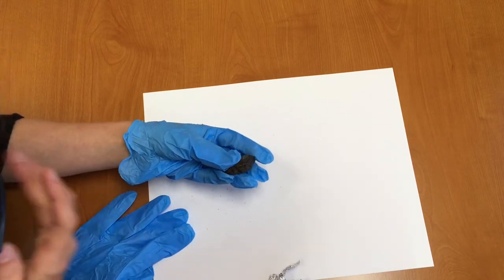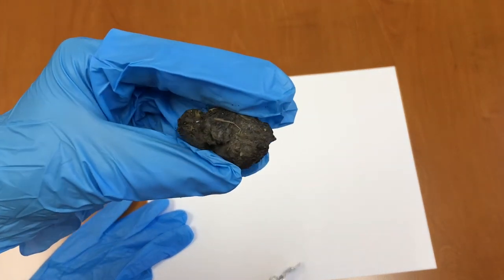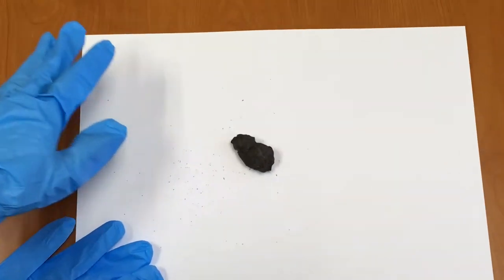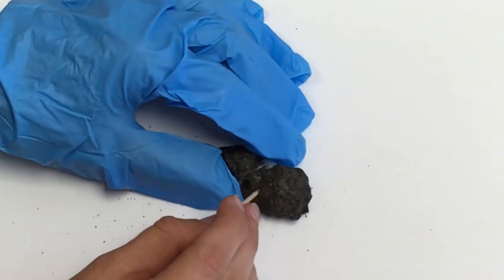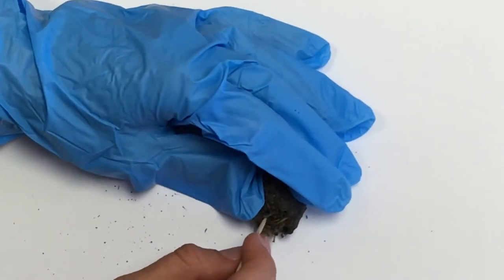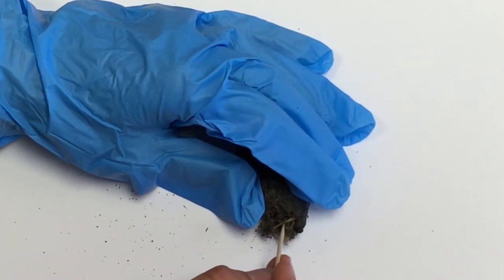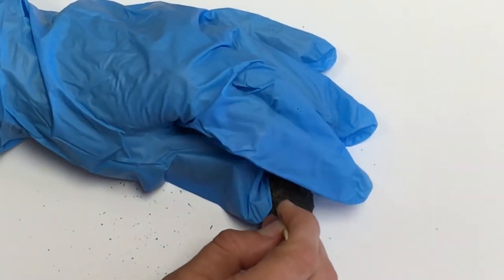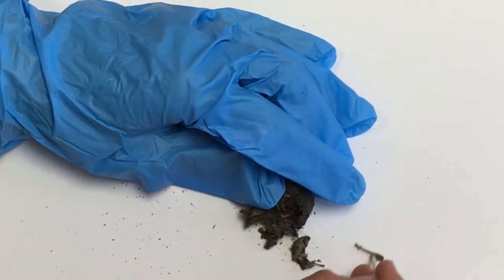I'm noticing right away that my owl pellet looks like it has some fur in it — you can see it looks a little bit fuzzy. I'm going to take a toothpick and carefully start breaking my owl pellet apart. I see a little bone in there! I'm just carefully taking my owl pellet apart, digging through with my toothpick, and I'm going to separate the bones and put them in a pile.